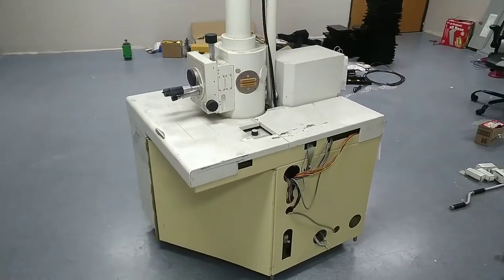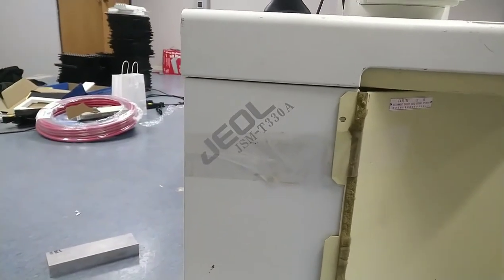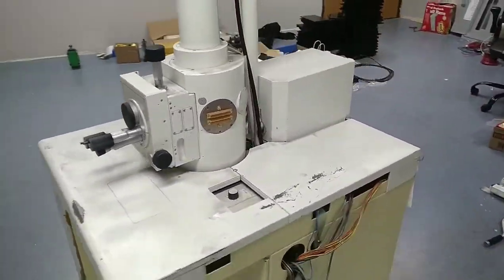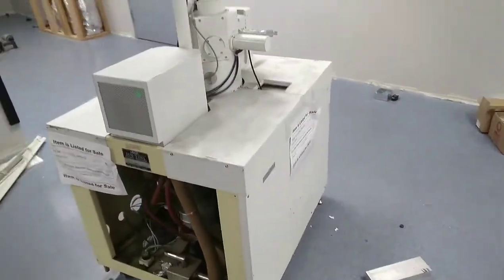Managed to pick up a JSMT 330A electron microscope. This one has a pink label on here somewhere. It was marked for scrap, so I picked it up for $300.